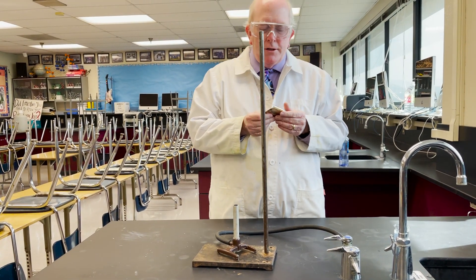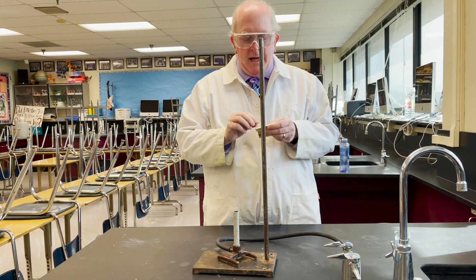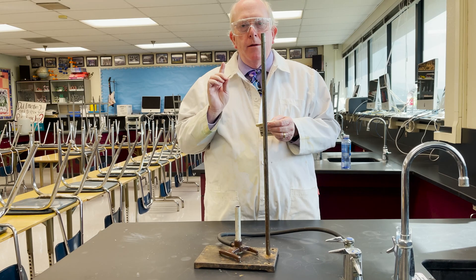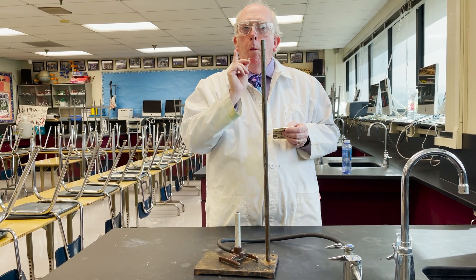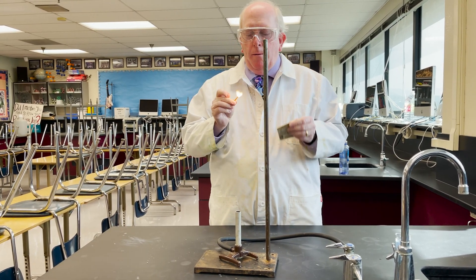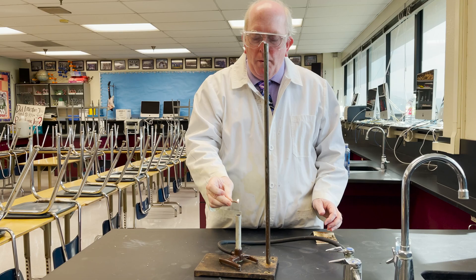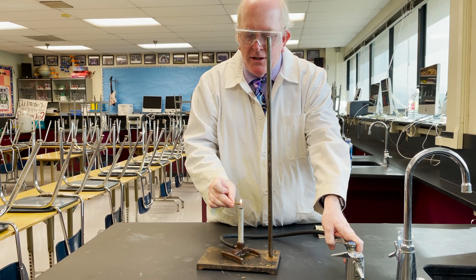Take your matches, or if you have a fancy striker or something along those lines, you can use that. Always light and position the match first. I like to say that it takes one Bravo student to light a Bunsen burner — we light the match, we hold it over the Bunsen burner, and then with your other hand, turn on the gas.